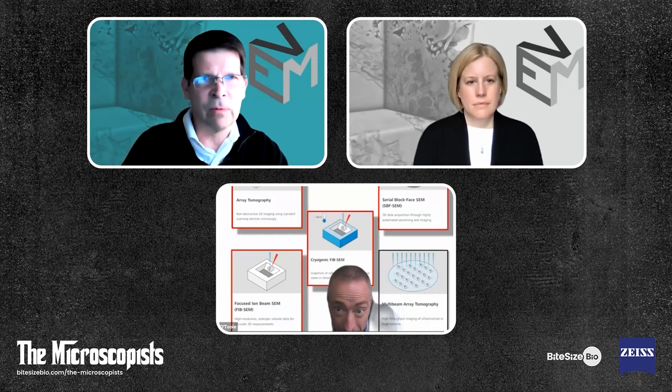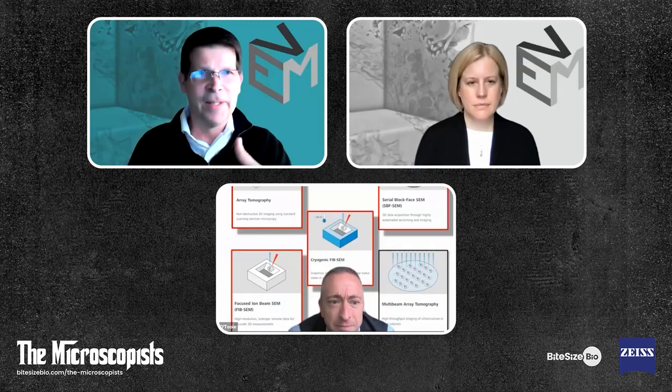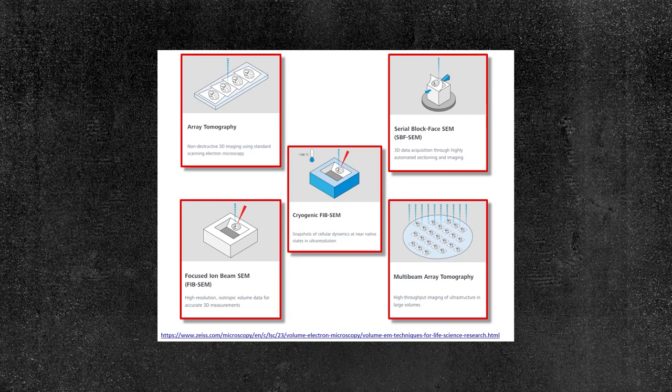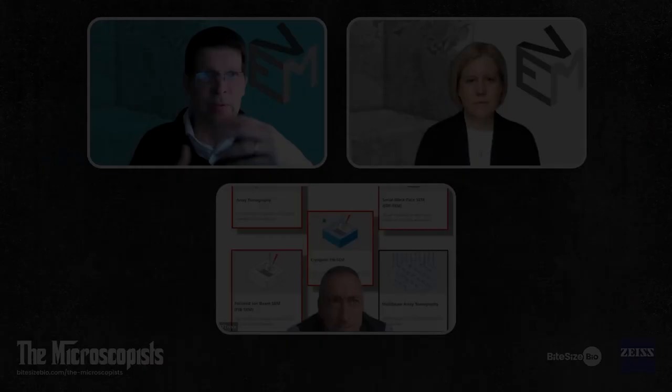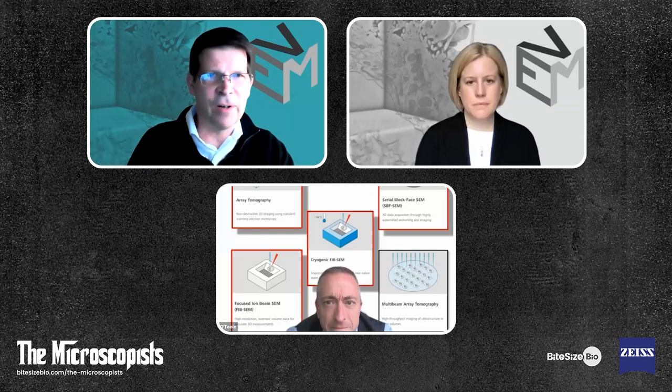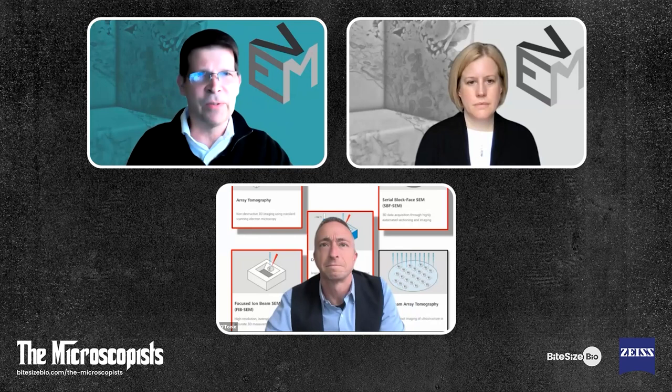But there are several different techniques, aren't there, Kirk, on this? Yeah. So just to extend what I was saying a few moments ago, what we have to do with our samples is fix or immobilize them and stain them with chemistry that allows us to see them in the electron microscopes. One example for scanning electron microscopy is where you fix the materials, put metal stains in them, and embed them in a plastic, which you can section. One of the most common techniques, actually the lowest cost of entry, is called array tomography, where you can collect ribbons of sections and then reconstruct those slices into a 3D volume.